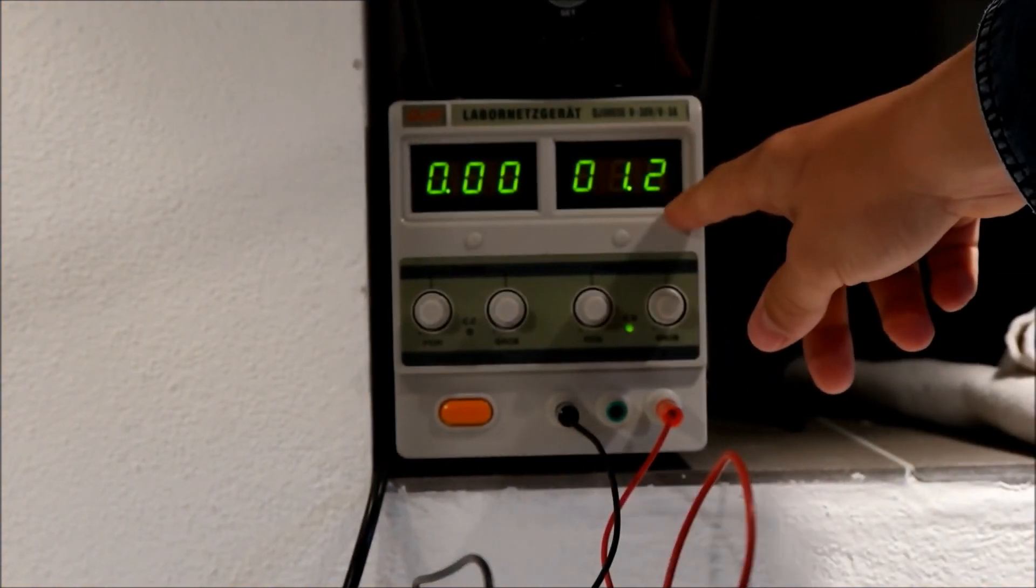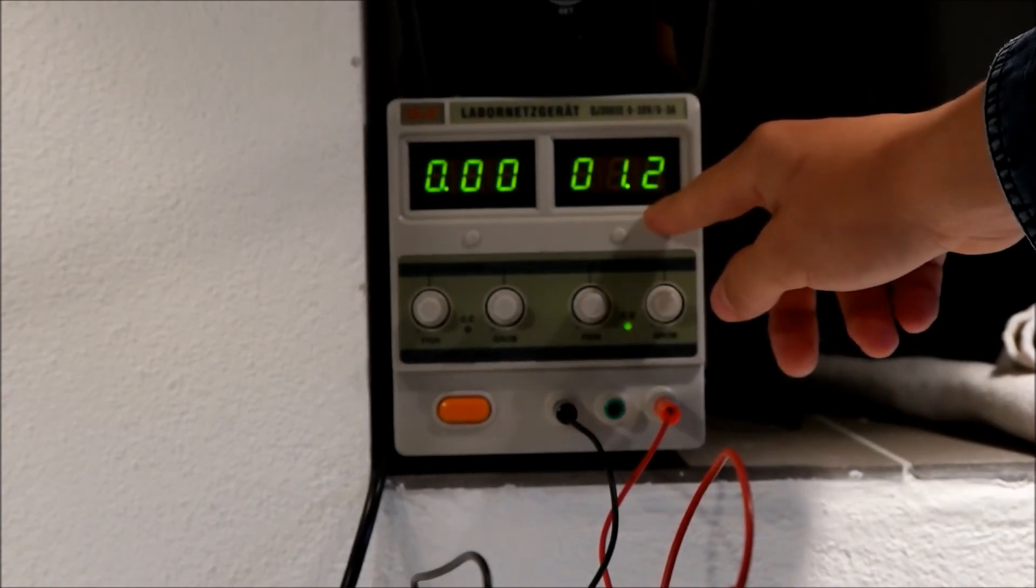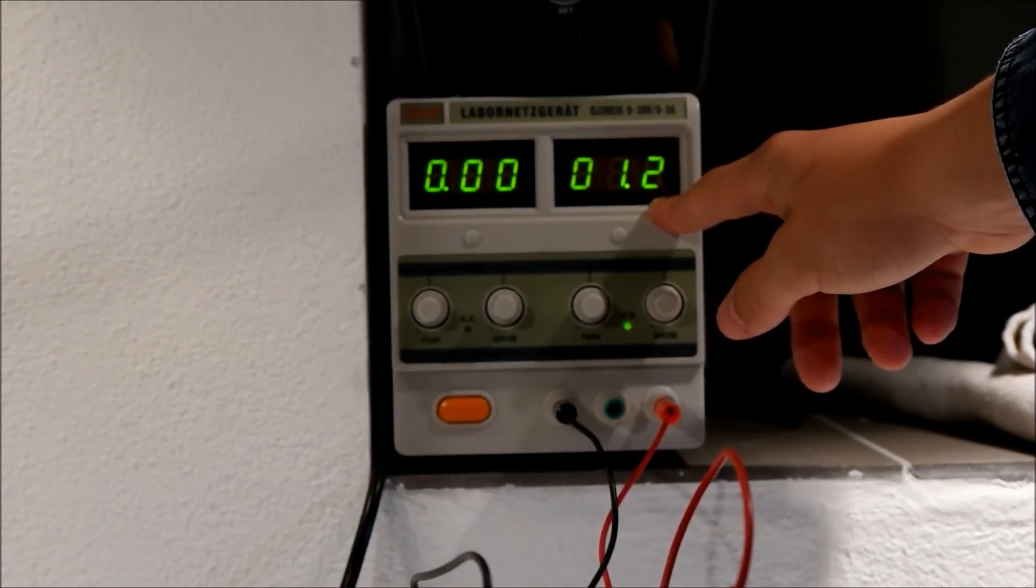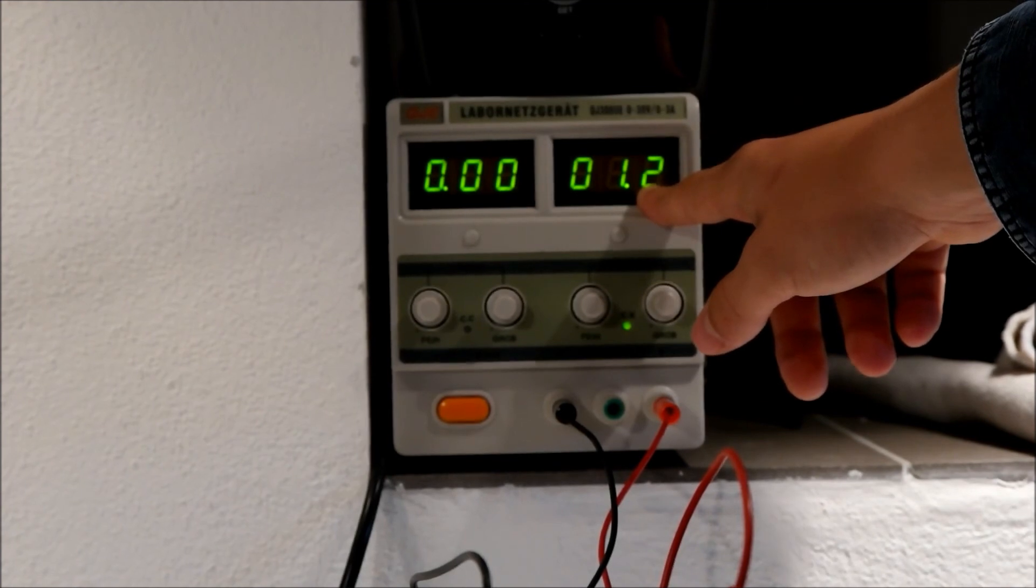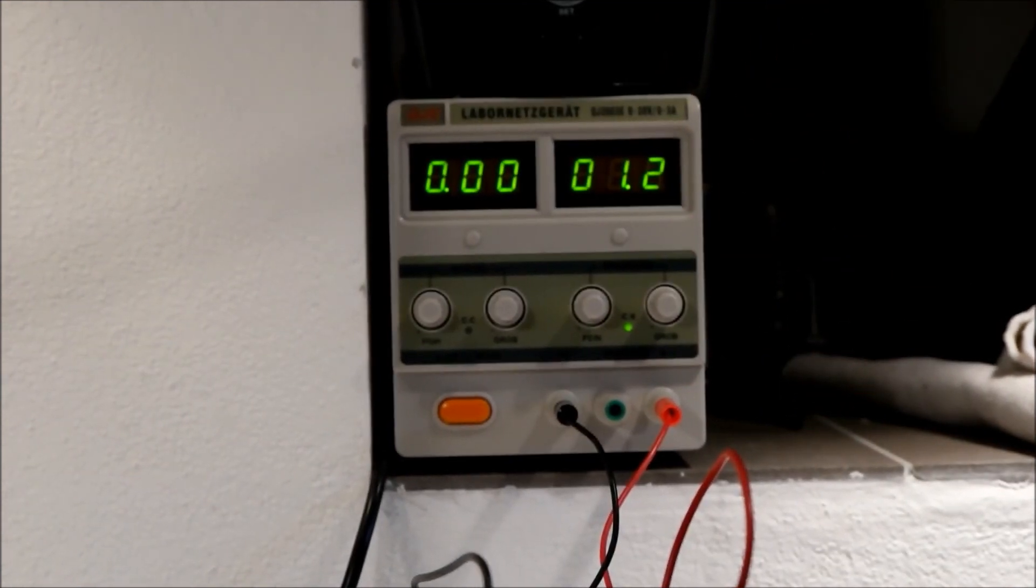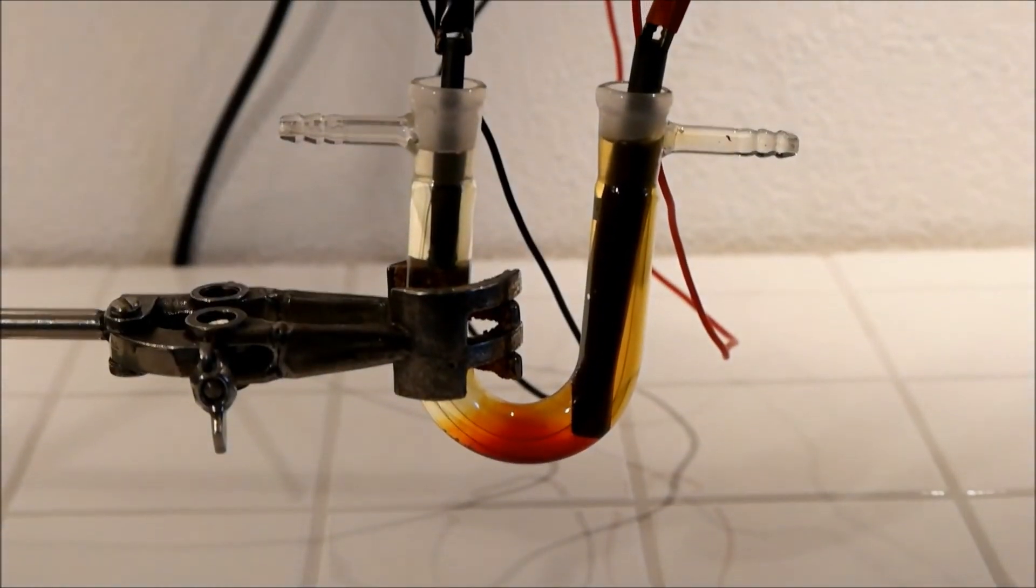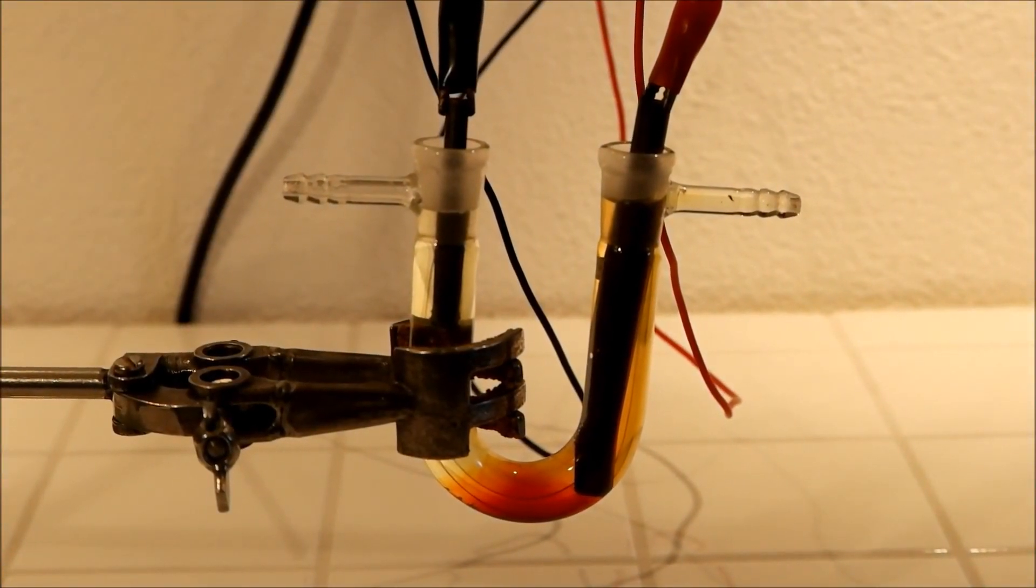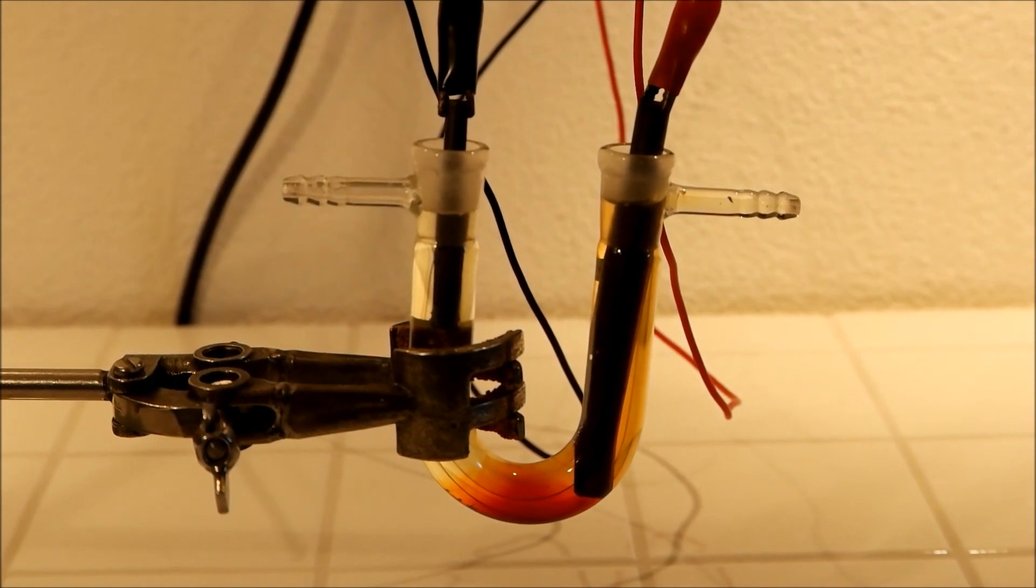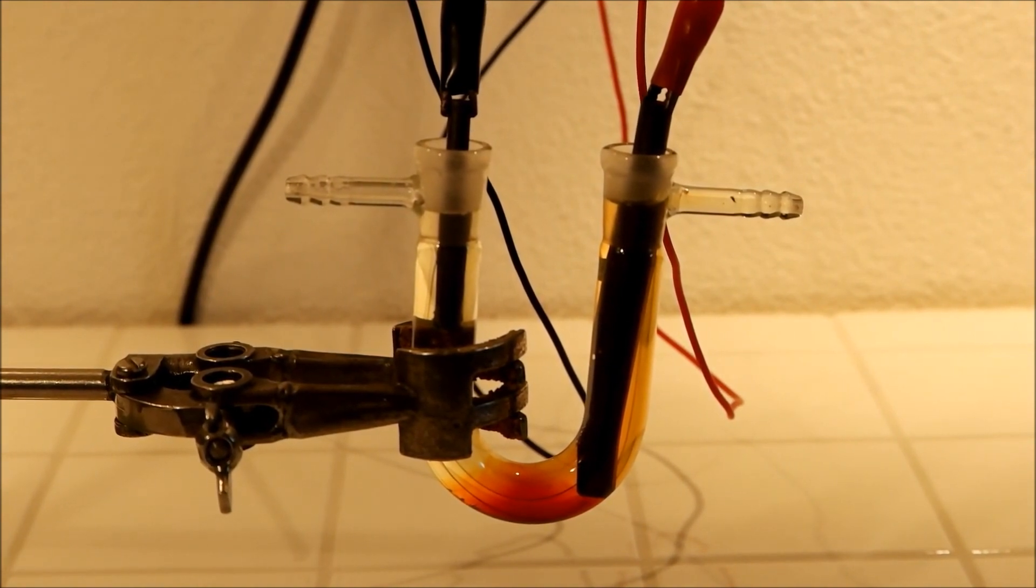Now there is still 1.2 volts shown and this voltage is because now it's something like the reverse reaction and the u-tube is something like a battery. So the pure zinc and the pure iodine get back to zinc iodide.